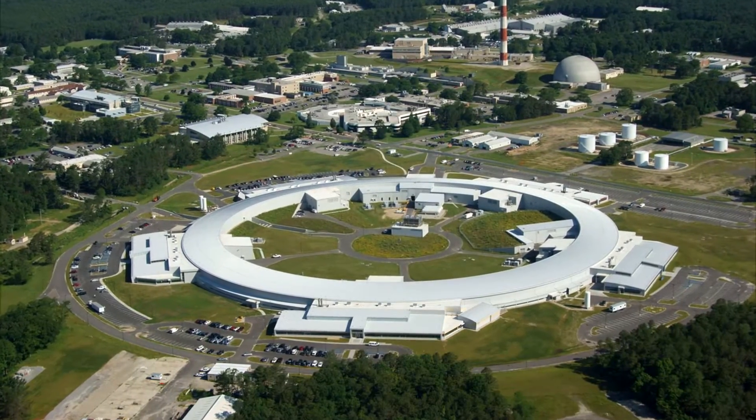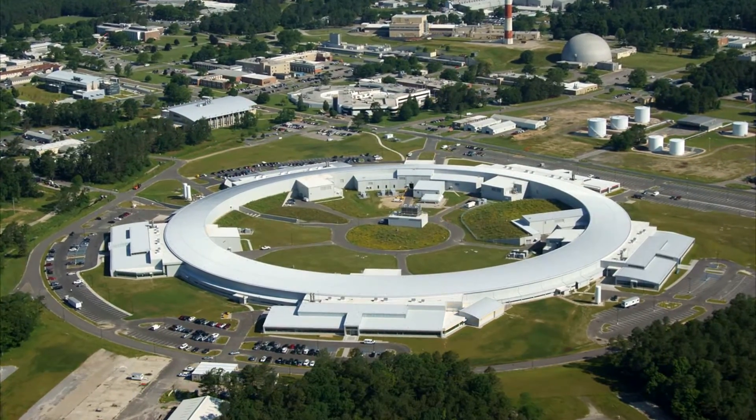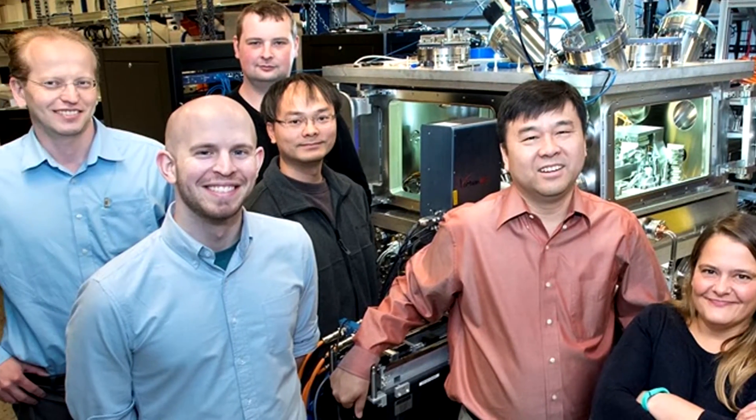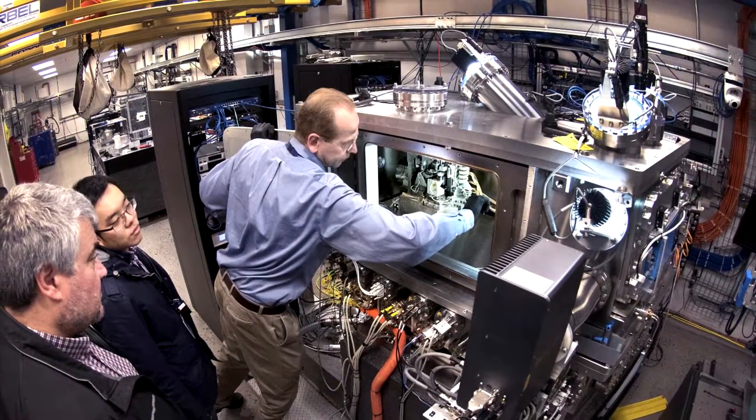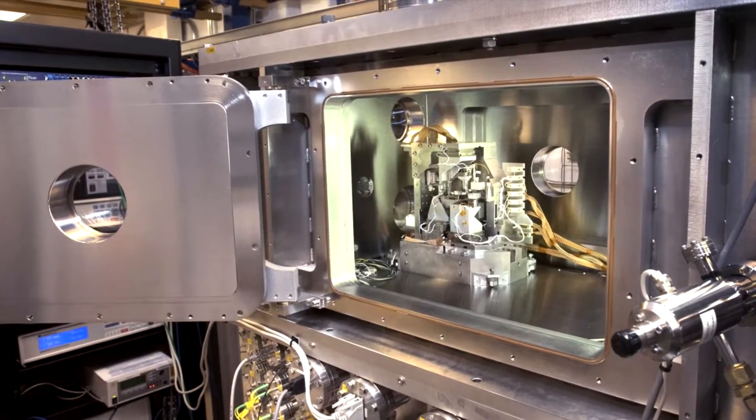Here at Brookhaven National Laboratory's National Synchrotron Light Source II, we have developed a unique, high-throughput, hard X-ray scanning microscope with multi-layer Laue lenses providing sub-20 nanometer spatial imaging resolution of chemical and biological materials.